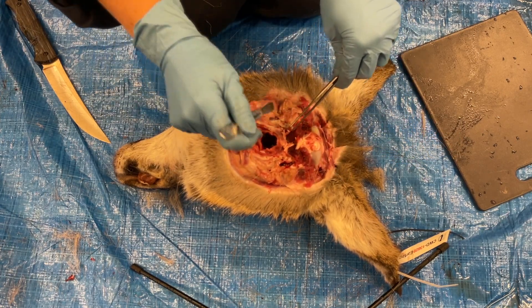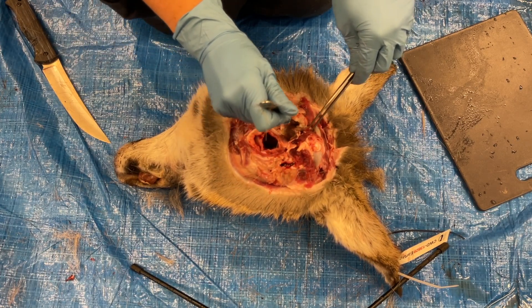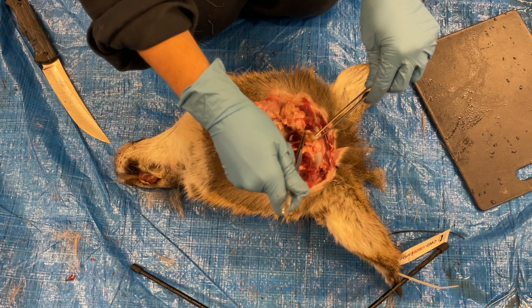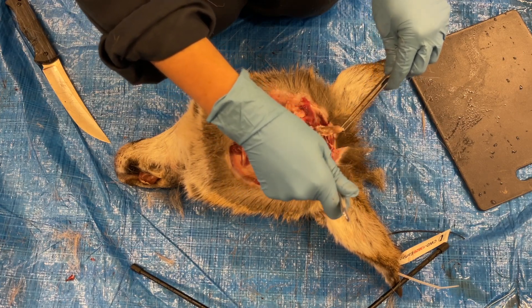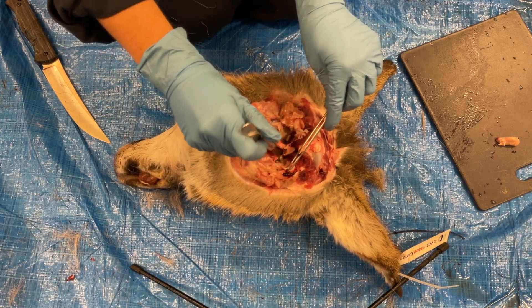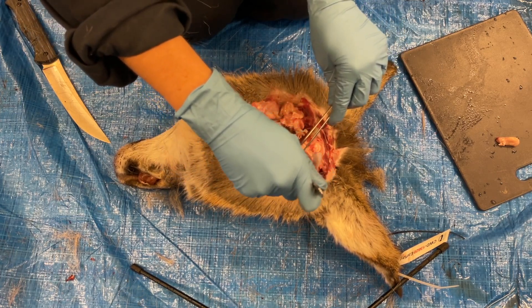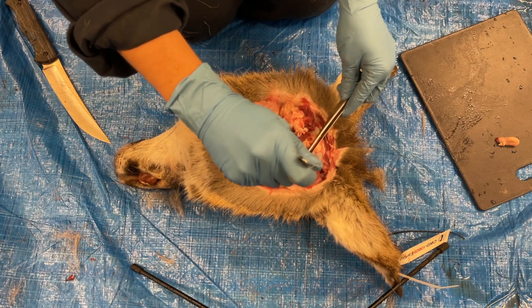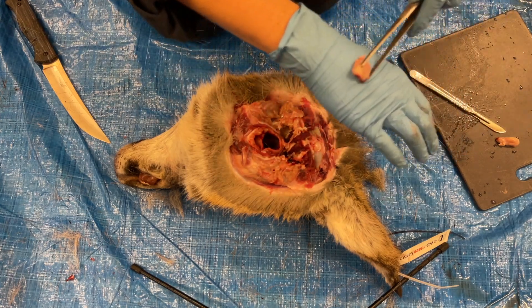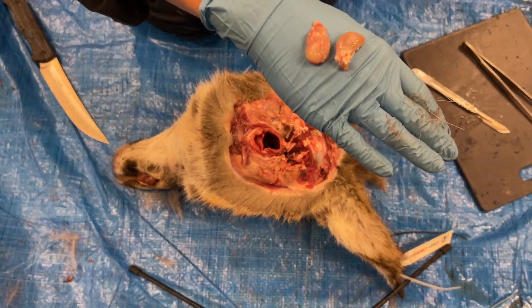Slowly dissect out the tissues being careful not to cut into the lymph nodes. Both lymph nodes have been successfully removed and are ready to be submitted for testing.